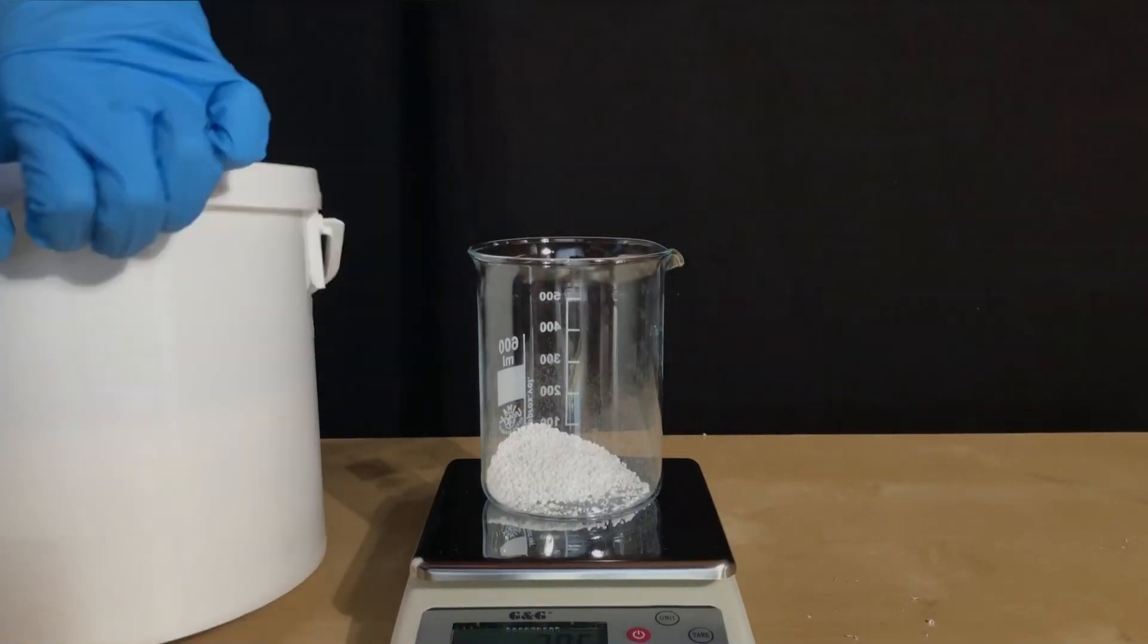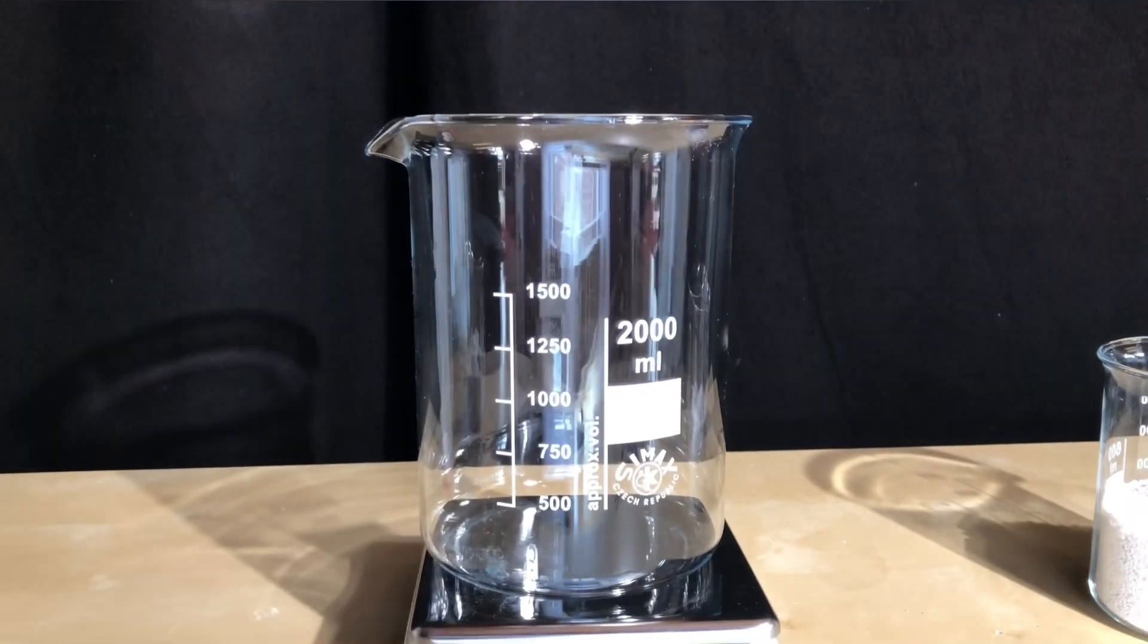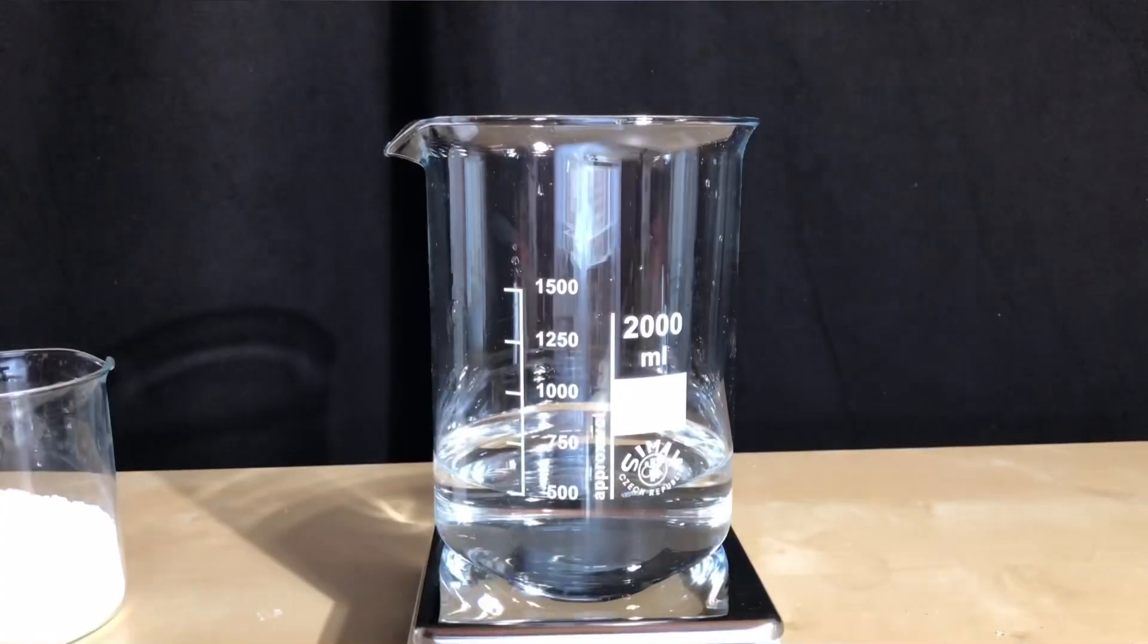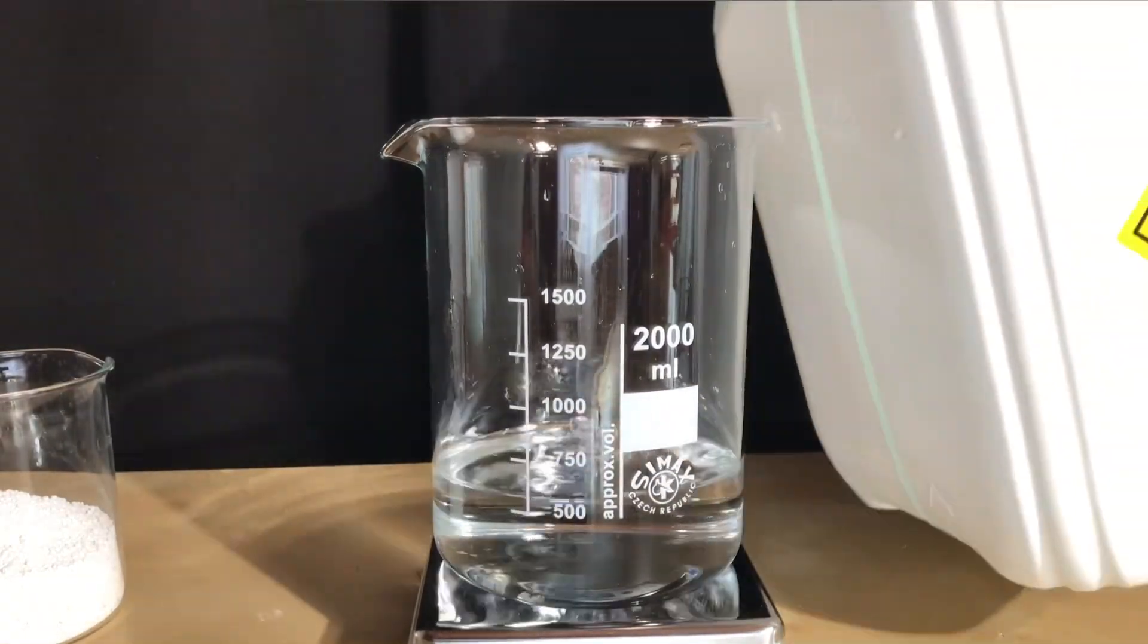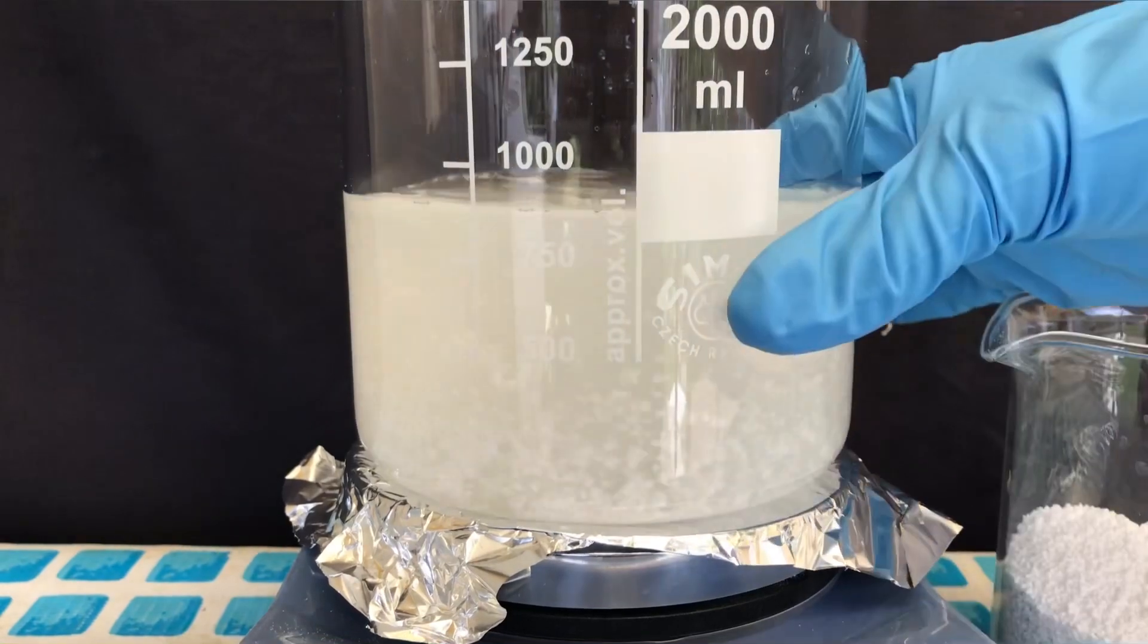We began by weighing out anhydrous calcium chloride and afterwards measured out about 750 ml of 11.9% hydrogen peroxide. The rest of it was added later on. Keep in mind, I cooled the hydrogen peroxide down using a fridge.